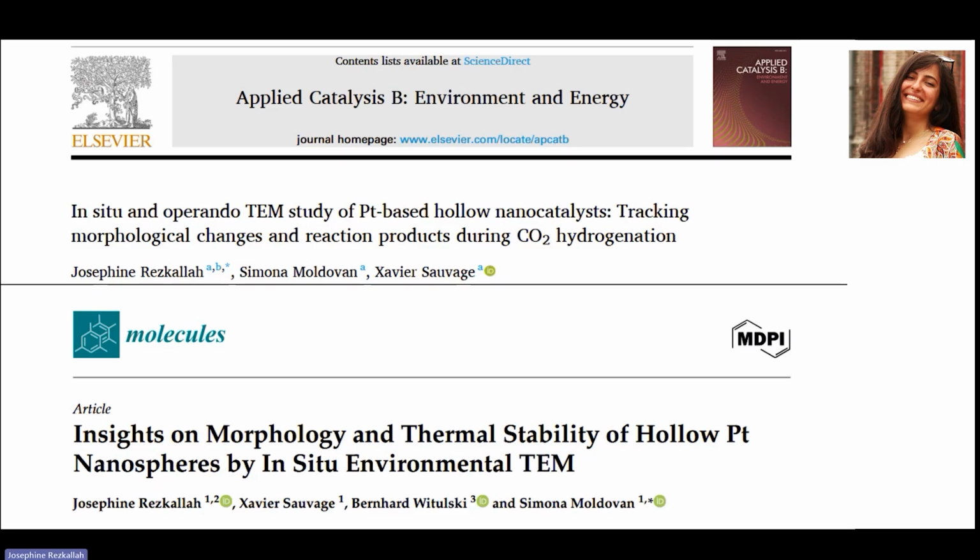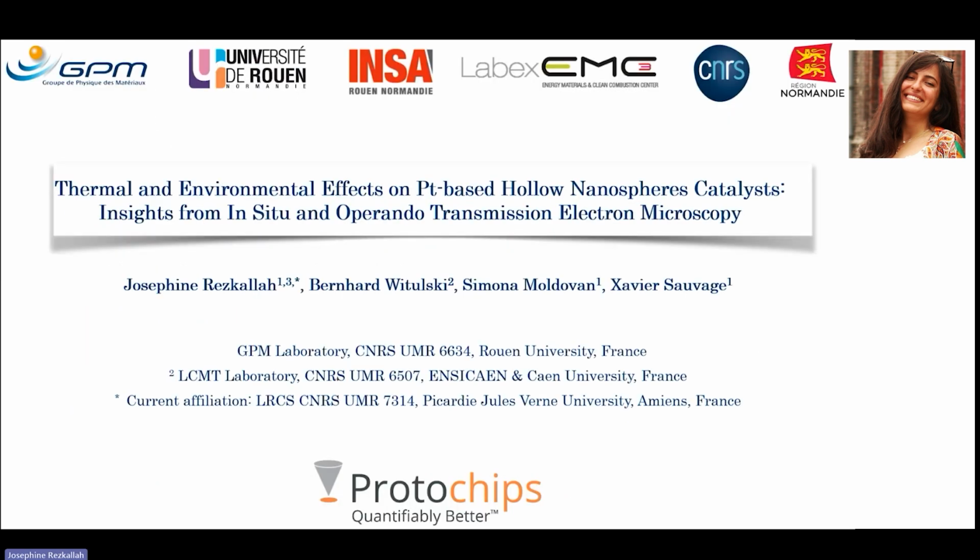My name is Joséphine, and today I'll be talking about our work, one part of which is published in Applied Catalysis, Environment and Energy, and another in Molecules. This work is mainly about the use of environmental gas transmission electron microscopy for catalysis research.